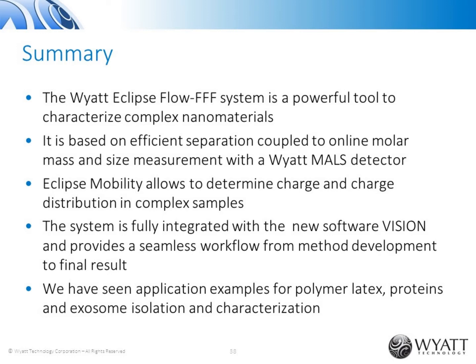The big advantage of field flow fractionation is that you can also have colloidal material or bigger aggregates in your sample, which you would need to remove if you wanted to inject on a column, which is not necessary in field flow fractionation. So typically, what you should do is remove oversized particles that are, let's say, above 10 or 20 microns, for instance, by a mild centrifugation, but there are no other special sample preparation steps necessary.